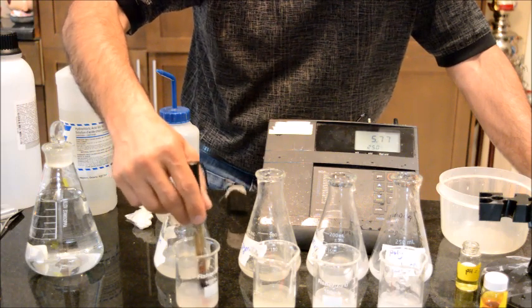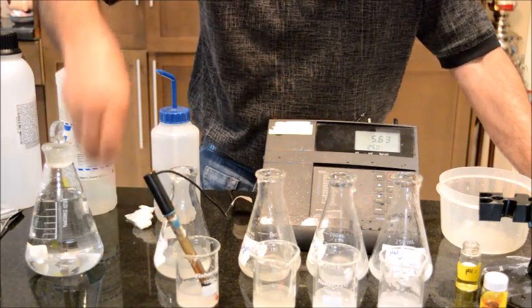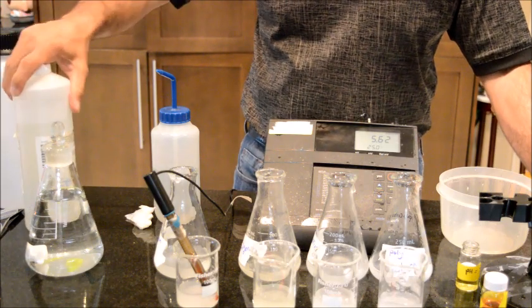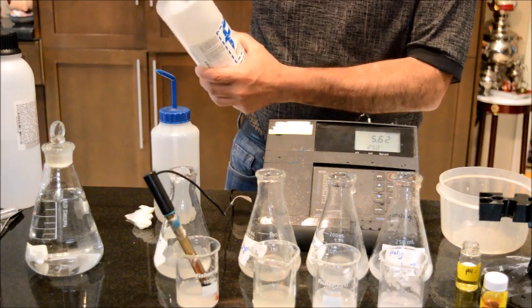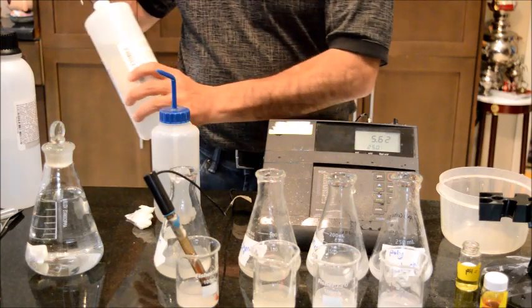So it is rather at a higher pH compared to the vaginal fluid. So I'm going to use hydrochloric acid, diluted hydrochloric acid, to decrease the pH a little bit. So this is 0.1% hydrochloric acid.